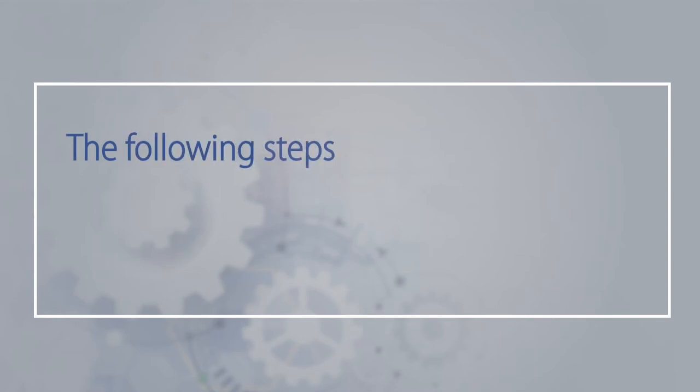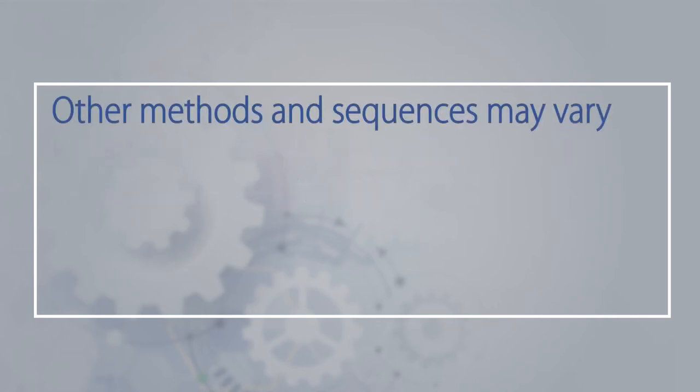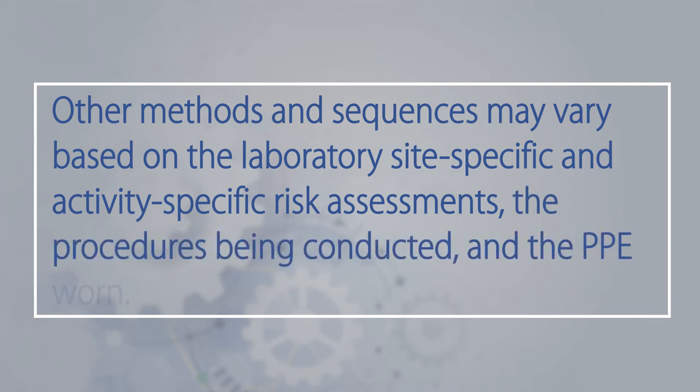The following steps describe one method and sequence of doffing PPE. Other methods and sequences may vary based on the laboratory site-specific and activity-specific risk assessments, the procedures being conducted, and the PPE worn.